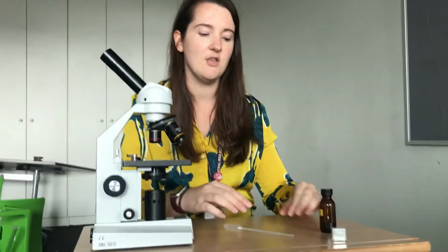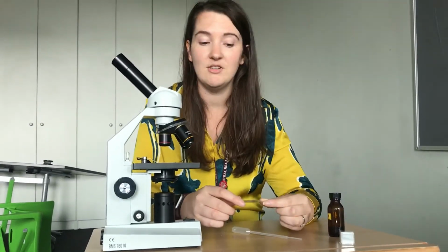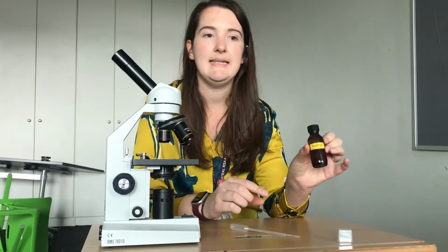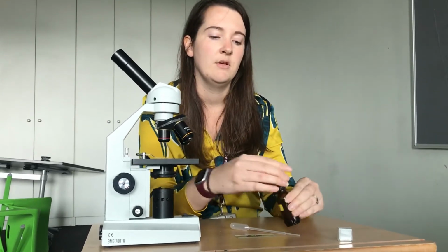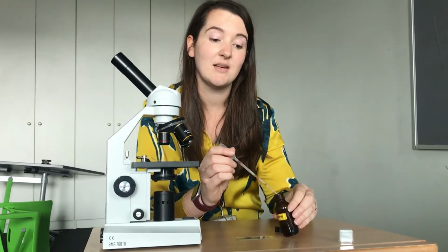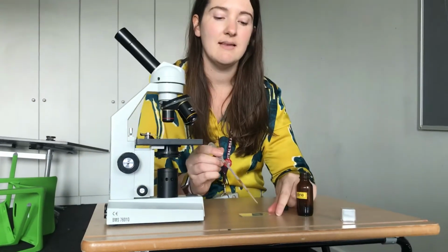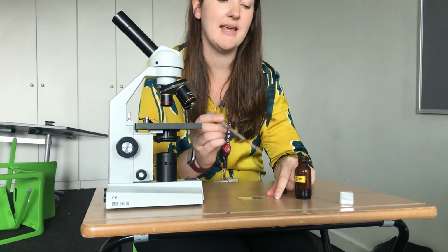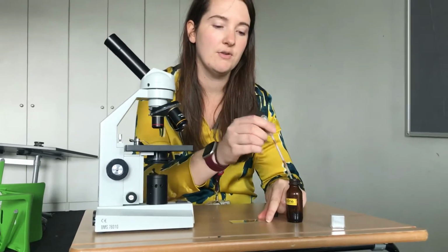So when you've got that and you put it on your slide, you're still not going to see anything unless you stain the cells. So we use iodine to stain the cells. So I'm just going to add a tiny drop of iodine. You have to be really careful with this because it stains. So anything that it goes on, it will stain. So I don't want to get it on my skin or on my clothes or anything like that.